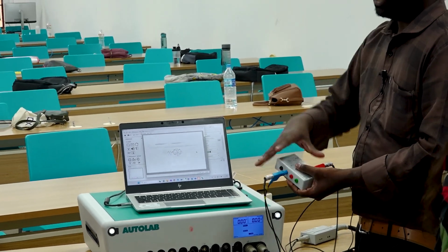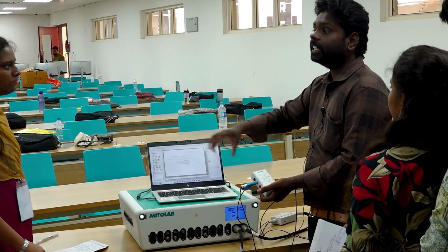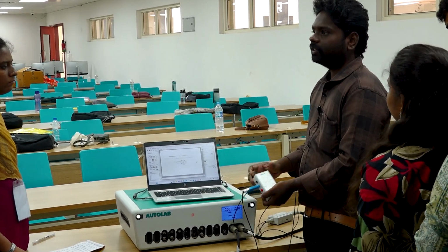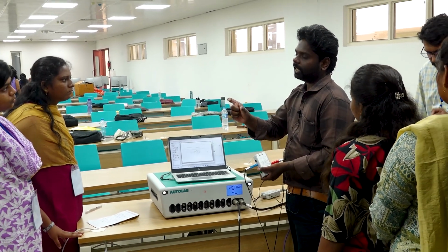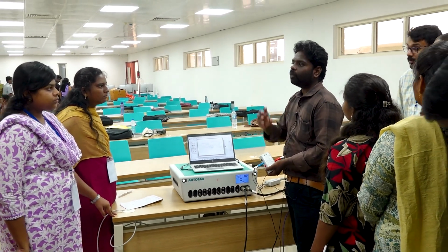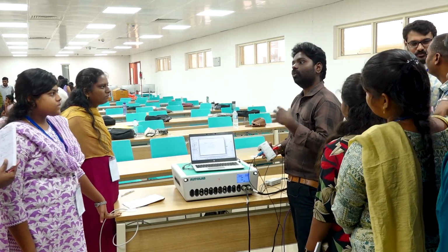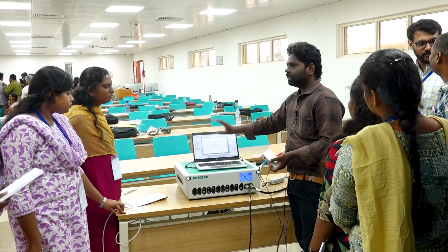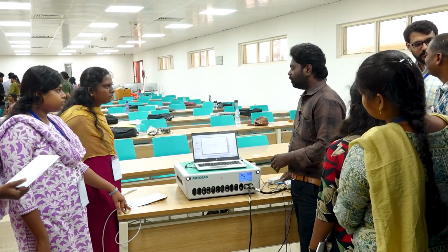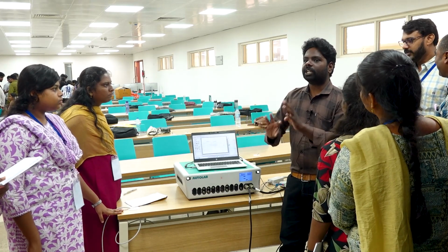So like this, it can simply extract the exact values. If you are doing an EIS test, the actual, exact data will come without disturbing your sample. That's why EIS is preferred over other techniques. So now I just copied the values and pasted here, and it automatically draws a circuit.